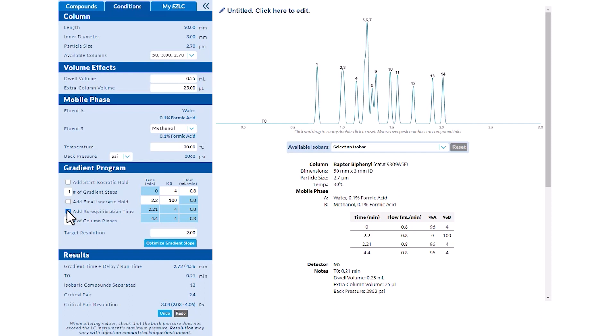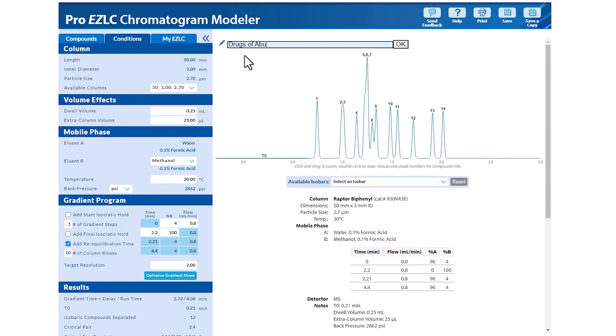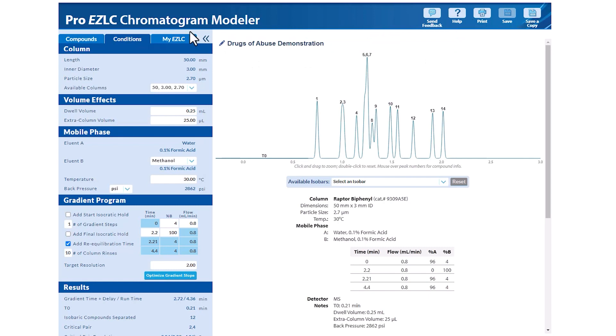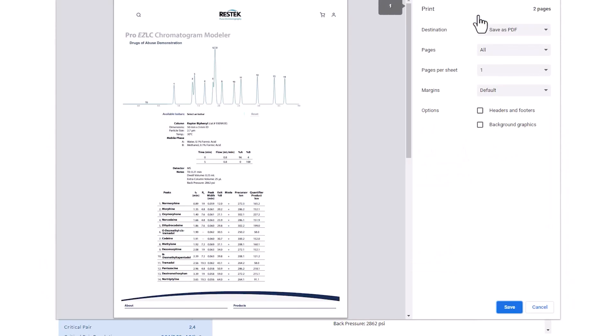Once you're satisfied with the simulated chromatogram and resolution values, you can name and save your model. This keeps it within your Restek account to reference later. You can also print it out for immediate use.